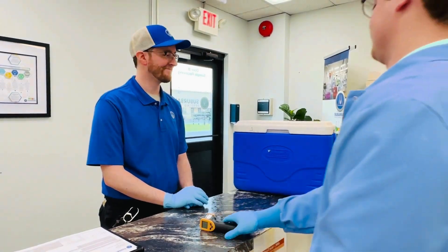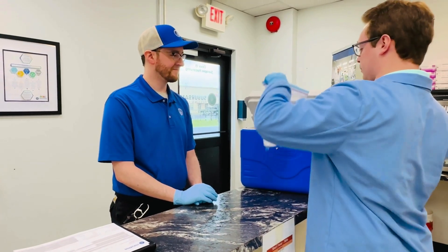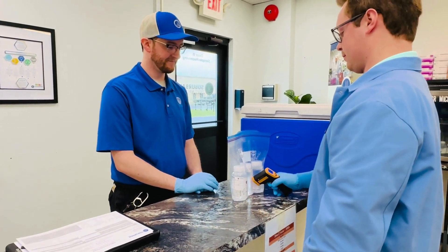Ensuring your data is defensible starts at the time of sampling. We want to ensure you have the knowledge you need to make your event a success.